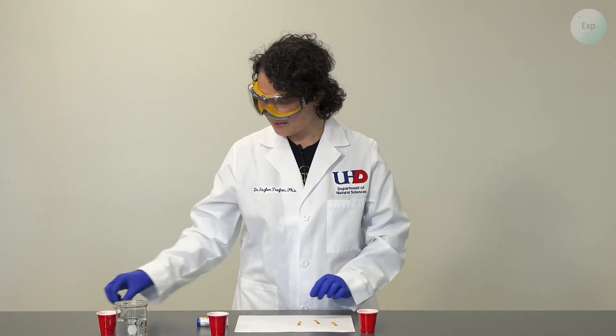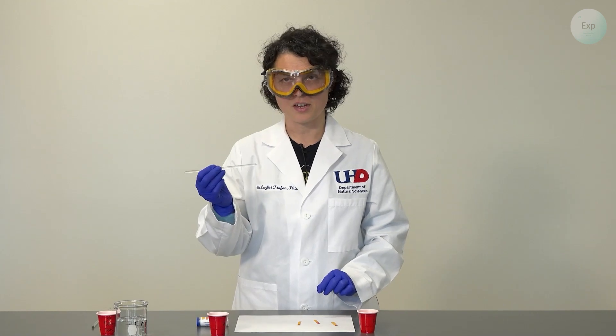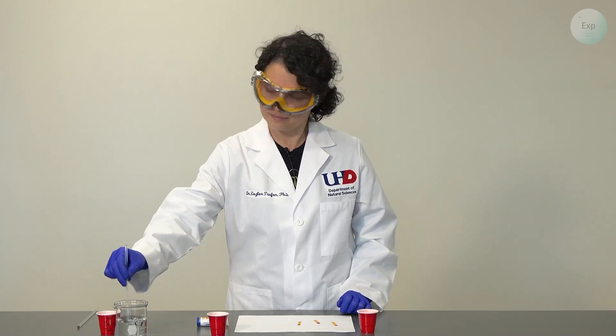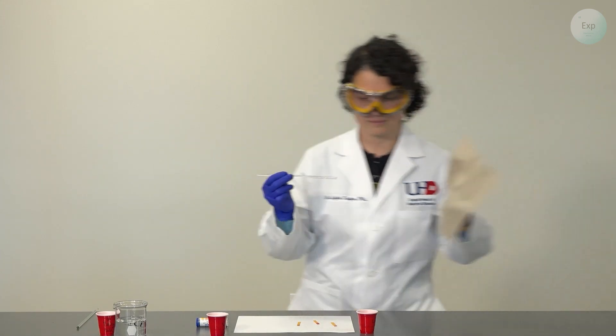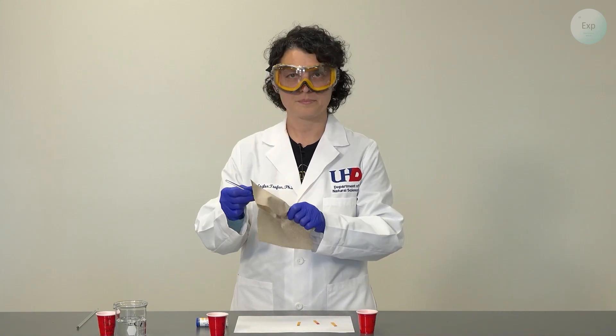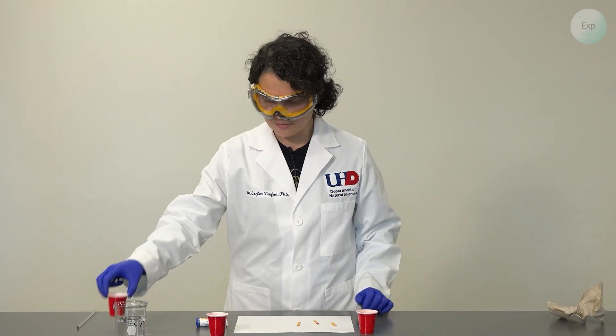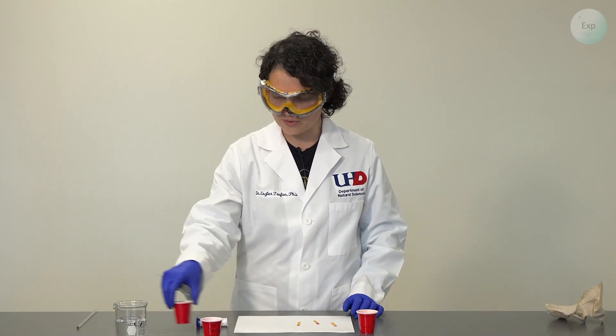For my final measurement I am going to demonstrate how to clean and dry our glass stirring rod, clean it, take a paper towel and dry it, and then we bring in our baking soda solution.